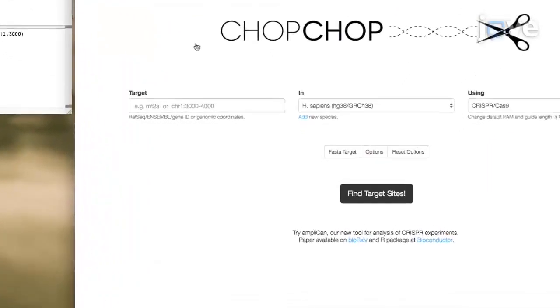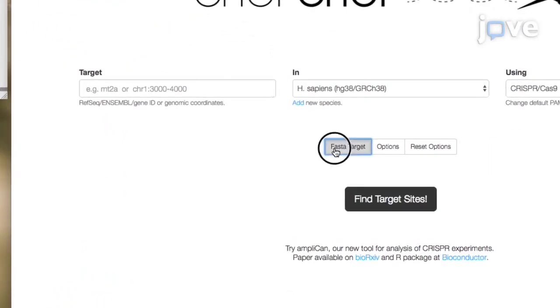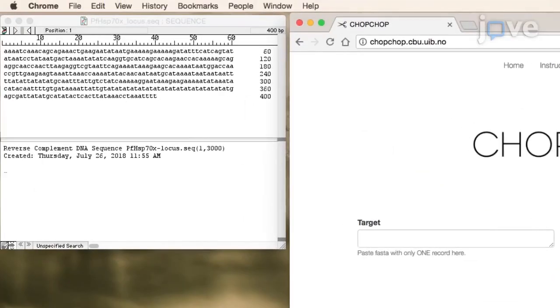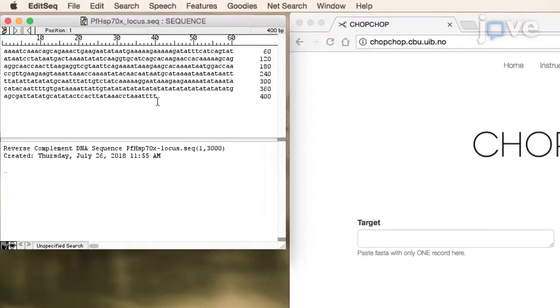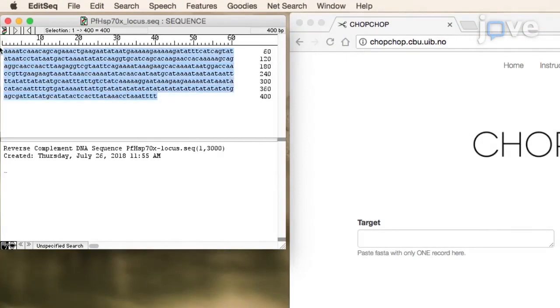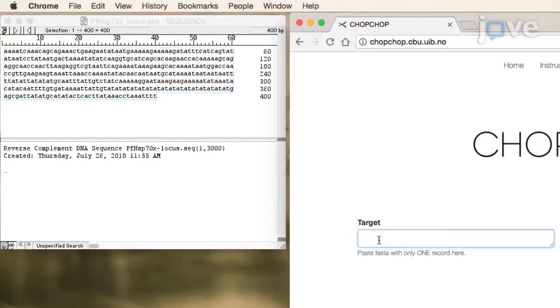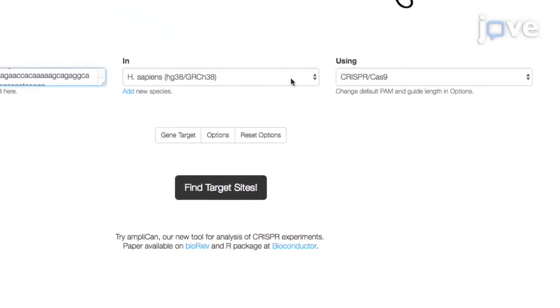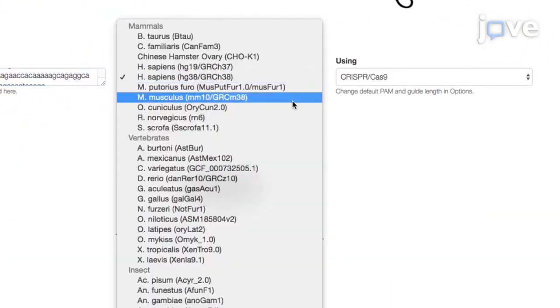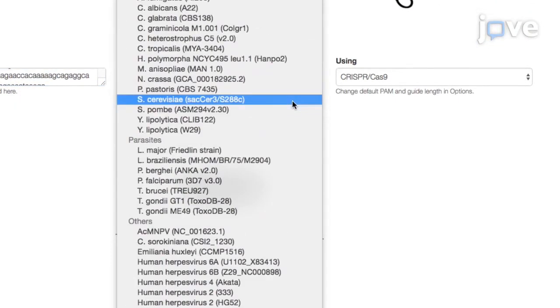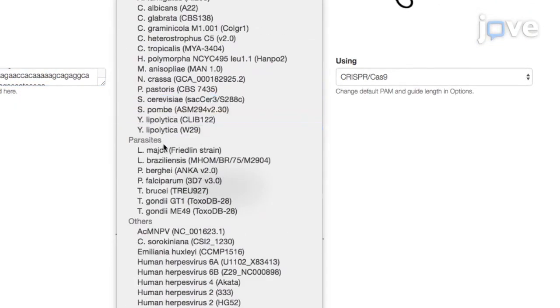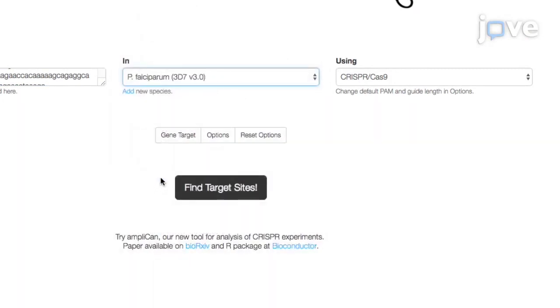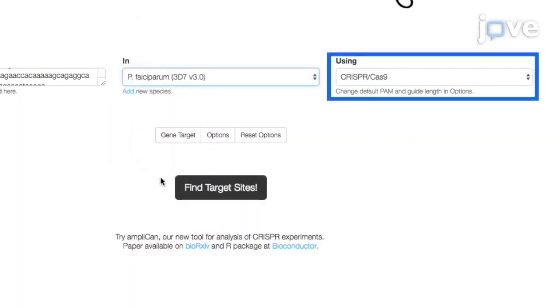To begin, go to CHOPCHOP and select FASTA target. Under target, paste the 200 base pairs from the 3' end of the open reading frame of a gene and 200 base pairs from the start of the gene's 3' UTR. Under IN, select P. falciparum and select CRISPR-Cas9 under USING.